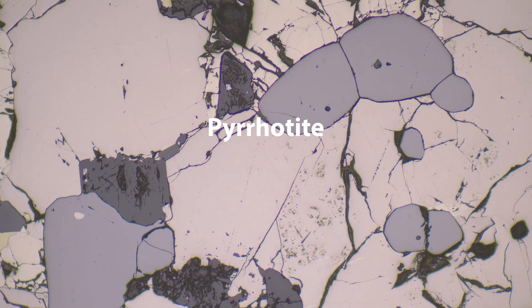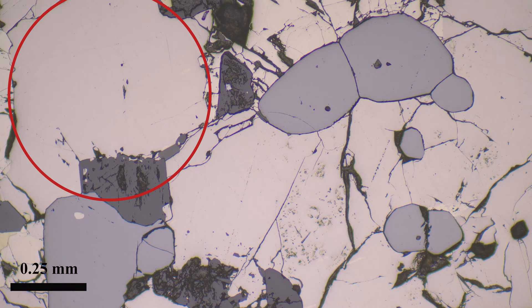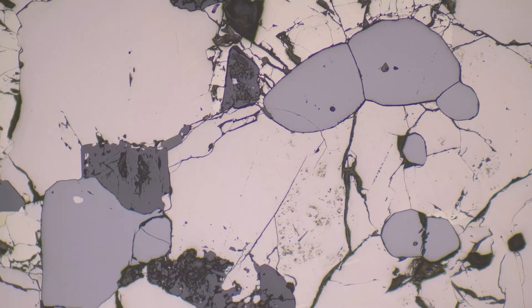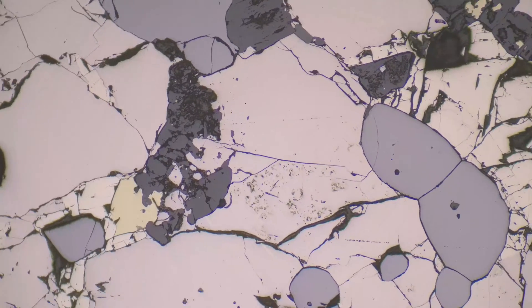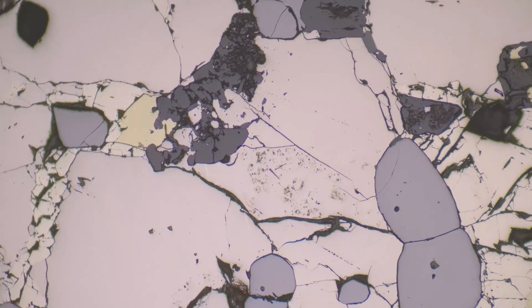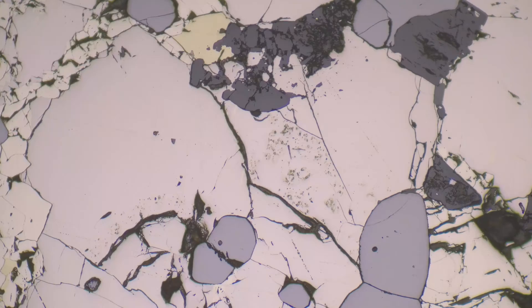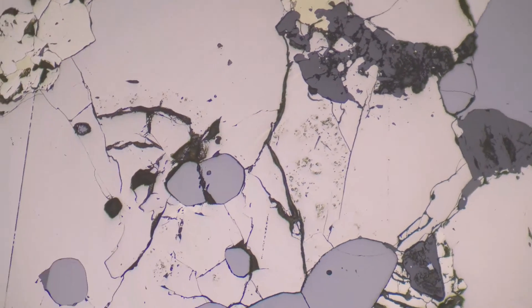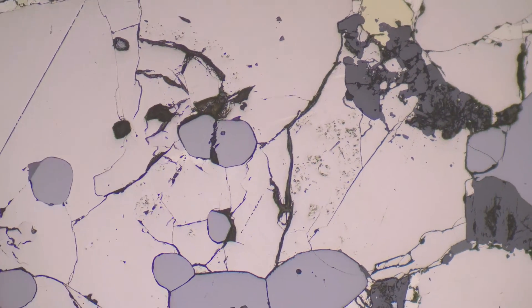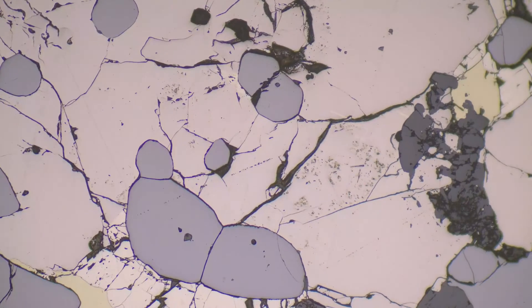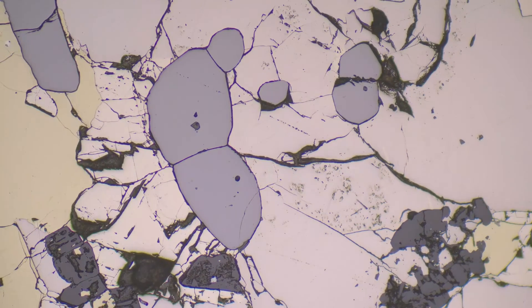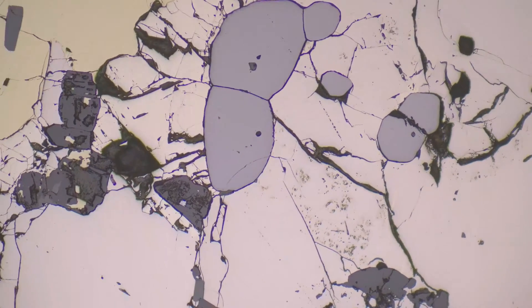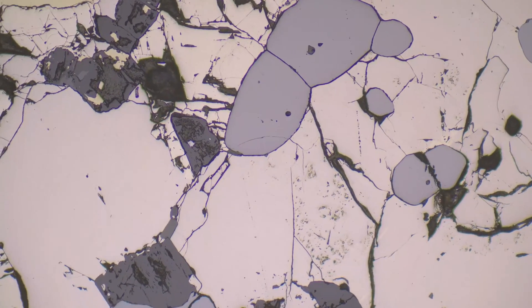Now we're looking at the mineral pyrrhotite in reflected light. It's much of this slide — this kind of pinky material that we're seeing. As we spin the slide you can see on the edges some of them are going from that pinky color into a paler color. There is also pyrite there — that's the paler color — but there are slight hints of the change.